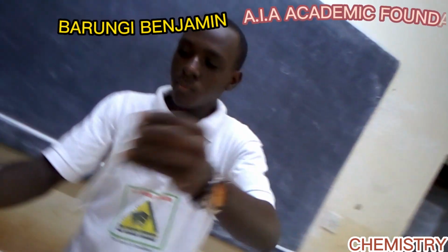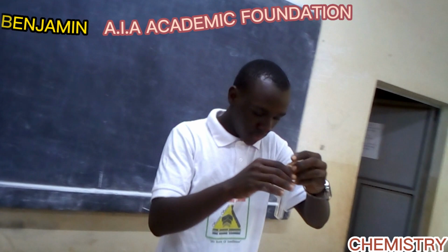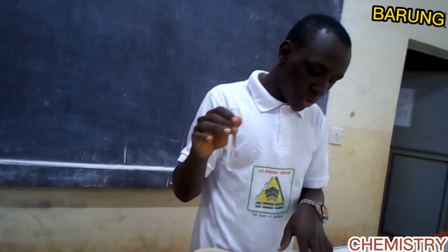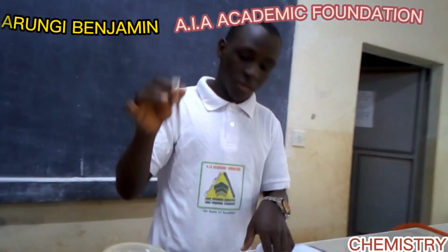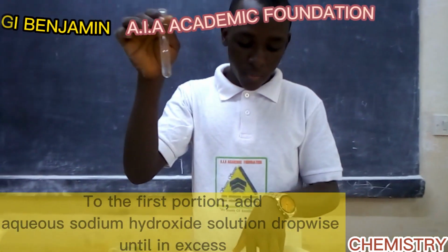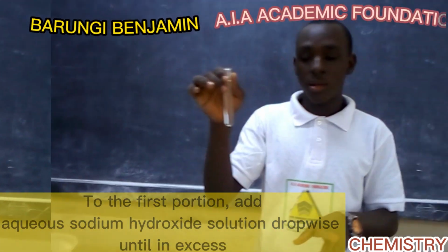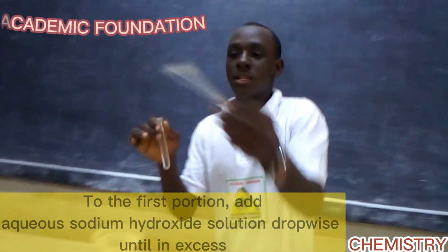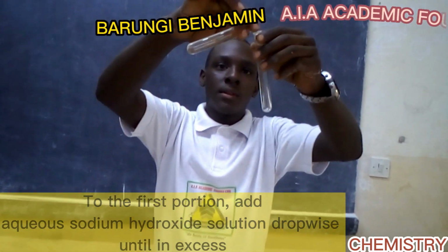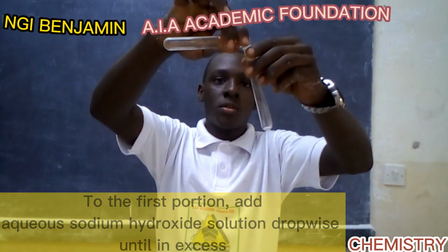So they have told us to divide this solution into 5 portions, and to the first portion, add sodium hydroxide. We are going to get our clean test tube and get the first portion.